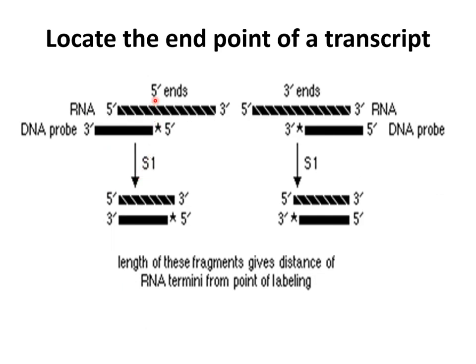So similarly in this diagram, you can find the probe. We design a probe and label the 5' region. Once you label the 5' region, you digest it. Once you digest it, you find the size from here to here. In this case, the probe size is 300 base pair. That means from here to here is 300 base pair away from the start site.